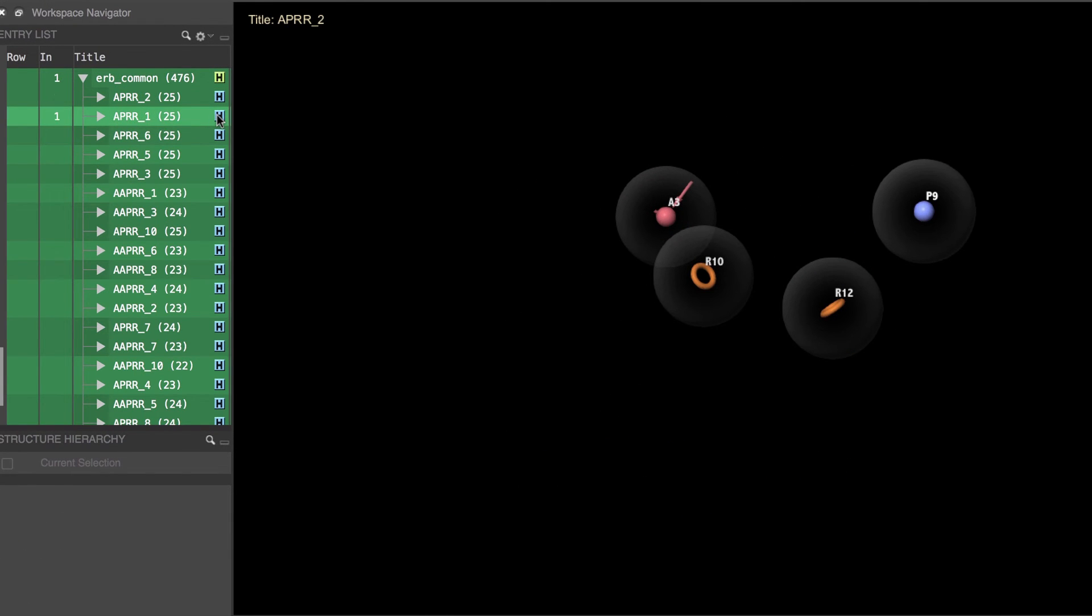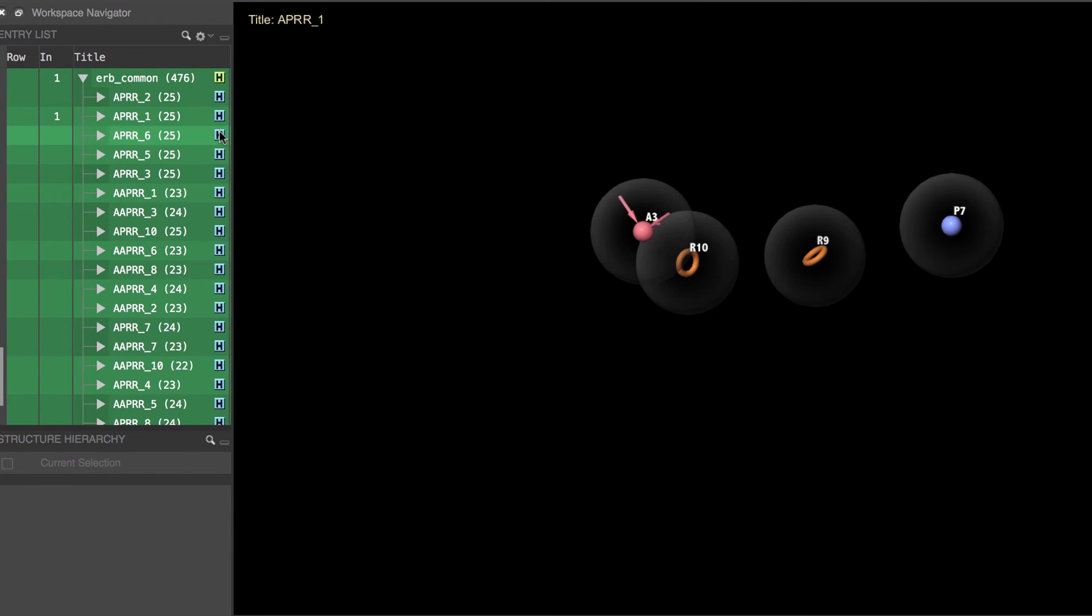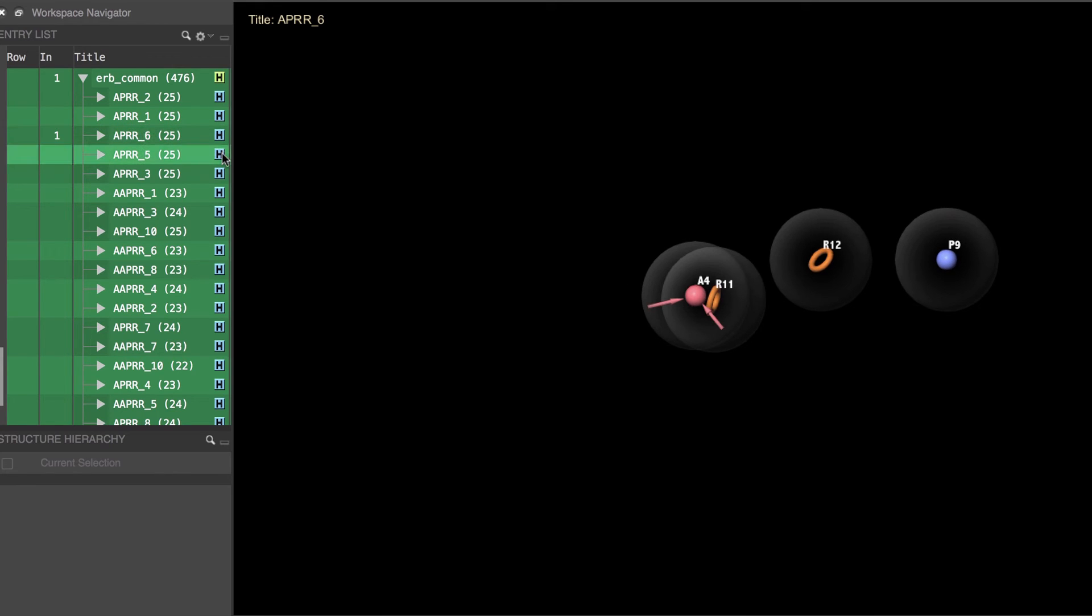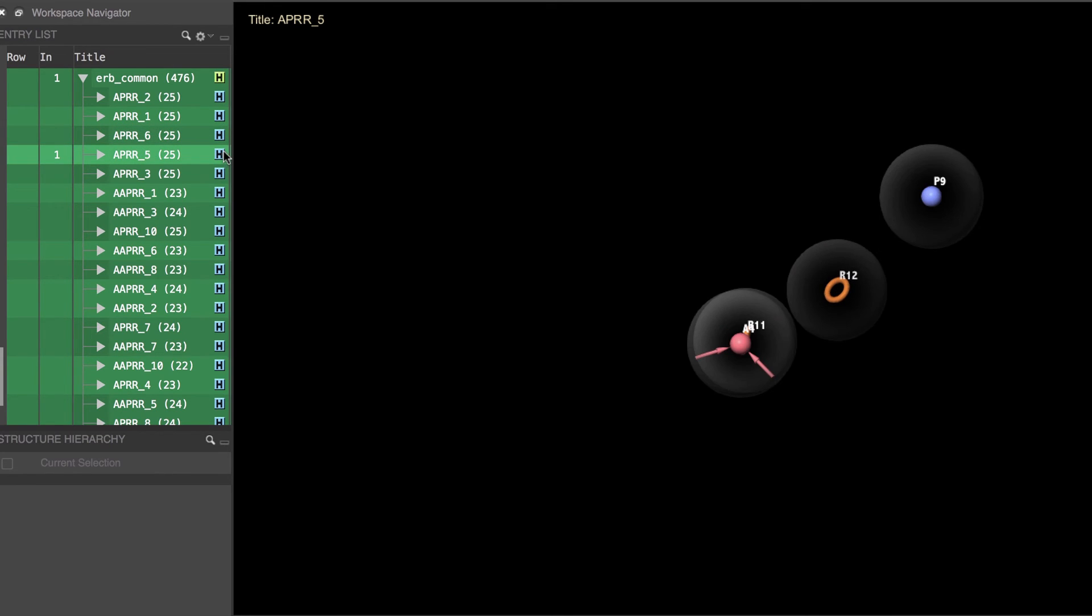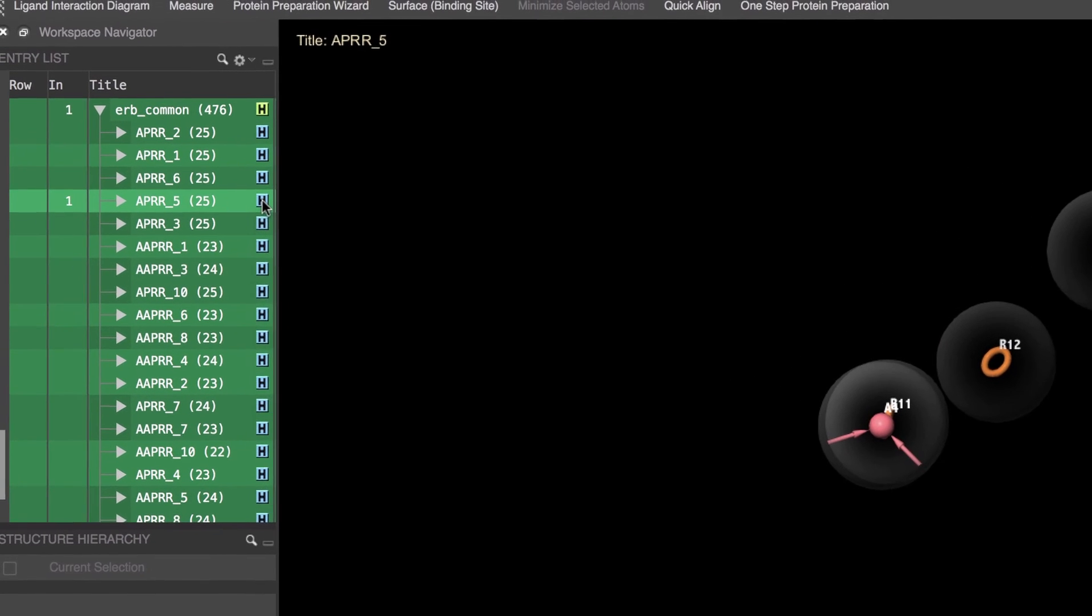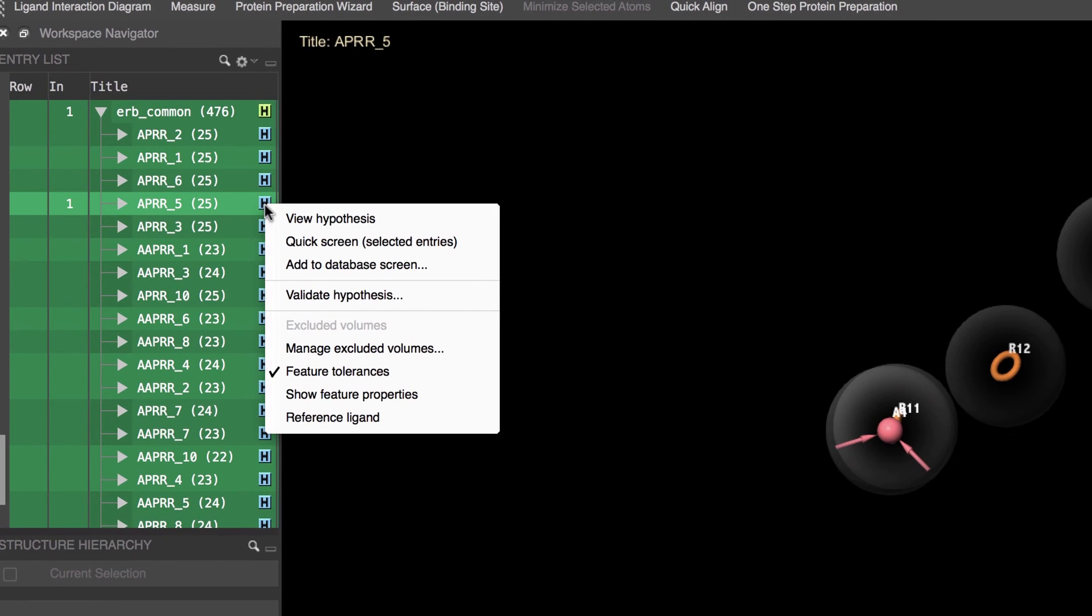Double clicking the blue H button is also a quick shortcut for viewing the hypothesis without having to open the group. A single left or right click on the blue hypothesis H button reveals a few more options specific to the given hypothesis like hiding the tolerant spheres.